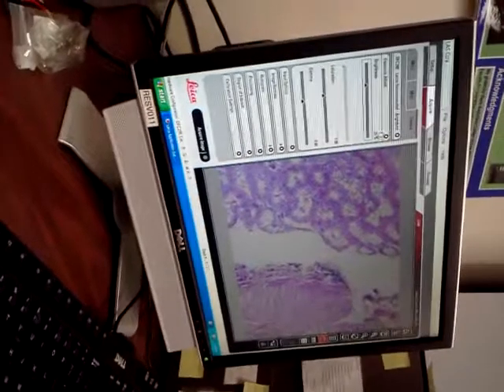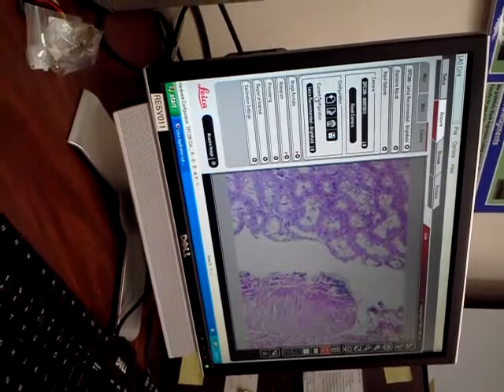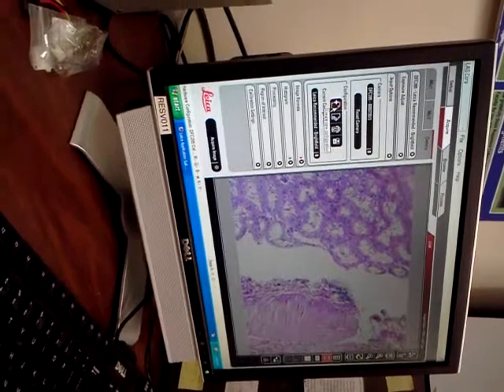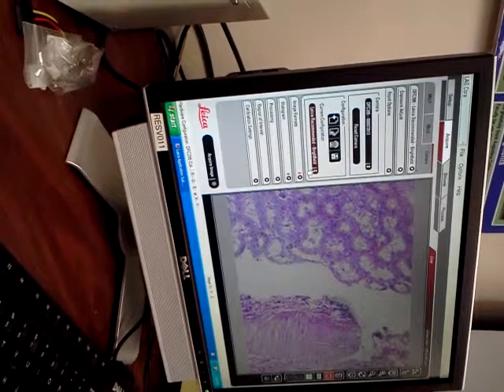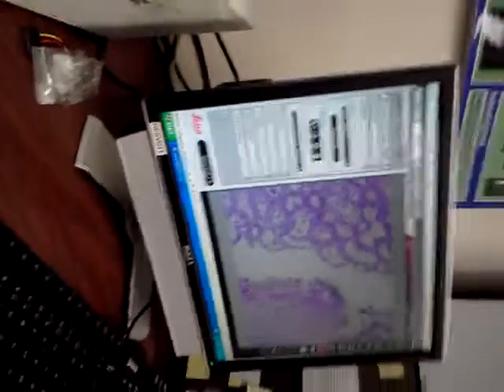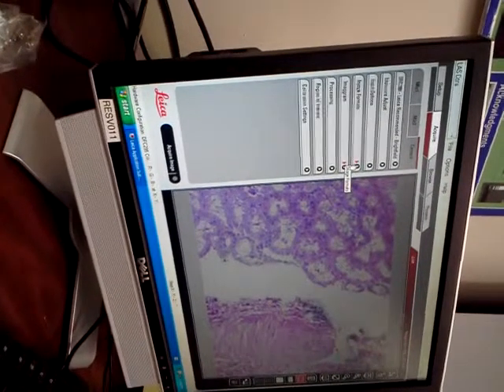That's what I was saying, is there a way to go back? There is, so that's why I made that right away for you guys. So there's a way to go back to kind of a recommended, but then you can always save your own configurations for certain dyes as well. Just click on the plus button, name it something, and then it'll come down here in the drop tab. And that'll save whatever you do within the acquire camera tab. Oh, that's good, because we do have some really different things that we're looking at. Right. And that way it keeps it the same across the board.